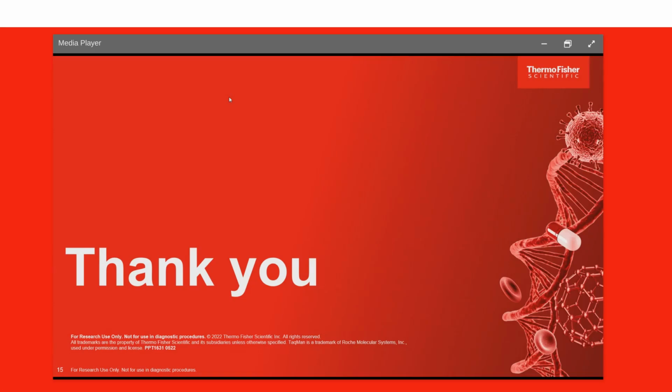All right, and it looks like we have time for one more question. Can TaqMan assays be ordered with reporter dyes other than FAM and VIC for deeper multiplexing? So the answer to that is yes.